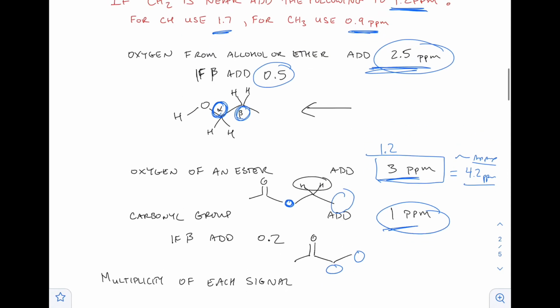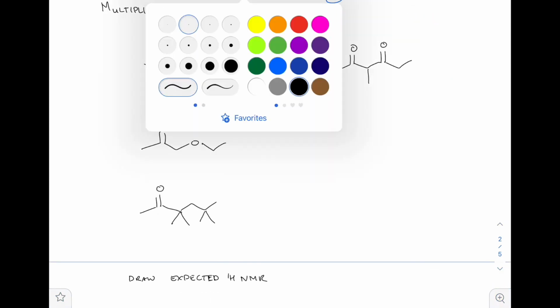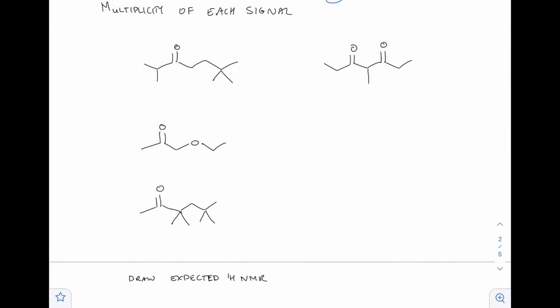Or to the right. And let's see, multiplicity of each signal. So I thought I might go over this as well, just because.